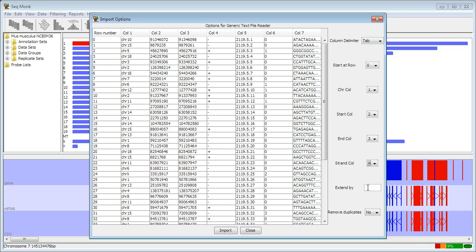A couple of options at the bottom which are applicable to all import filters. One is I can choose to extend each read as I bring it in. So although I may only have a 40 base pair read, I can choose to extend that up to 300 bases. This is useful for single-end ChIP-seq analysis where you can get a more realistic view of the fragments you imported.